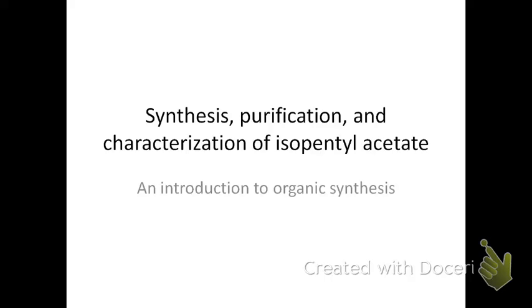I wanted to take you through the pre-lab for experiment 14A. This is our first synthesis laboratory, and we're going to actually make an ester, and this ester is known as isopentyl acetate. There's a very nice essay on esters and fragrances in your textbook, and you should probably read that for background information.